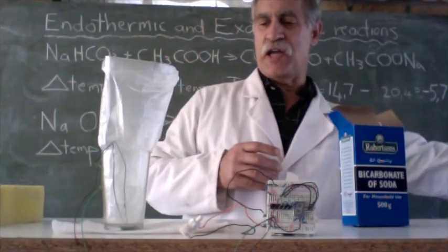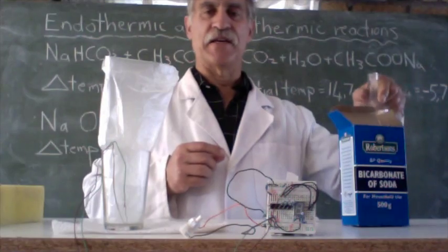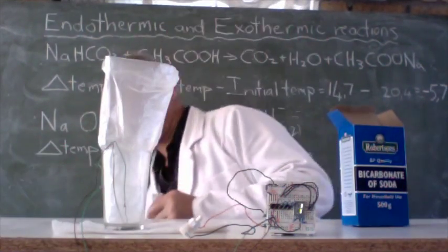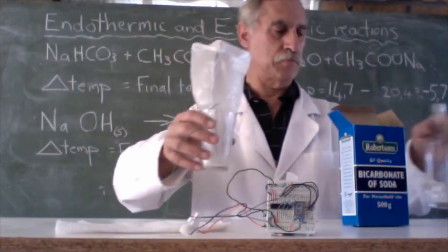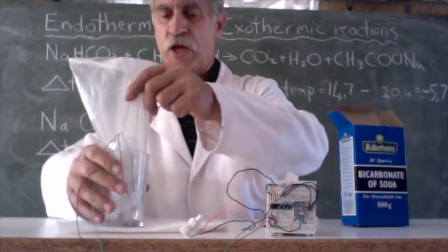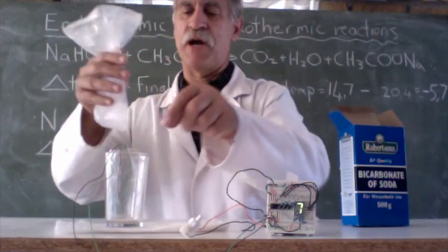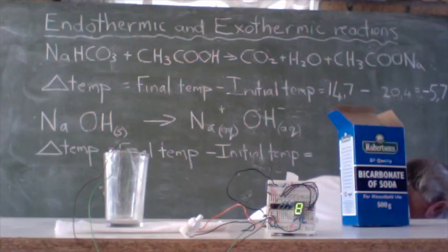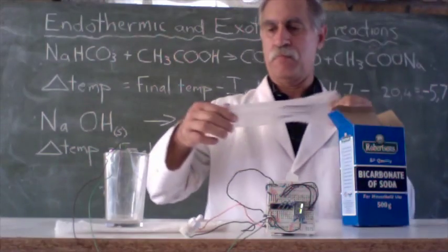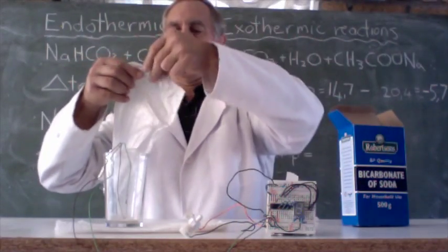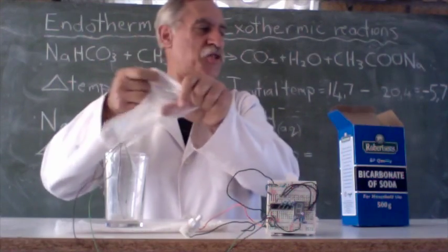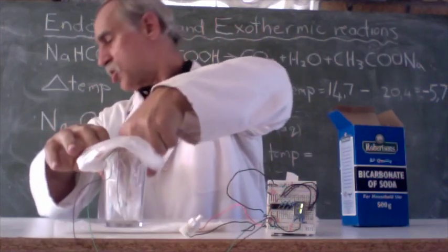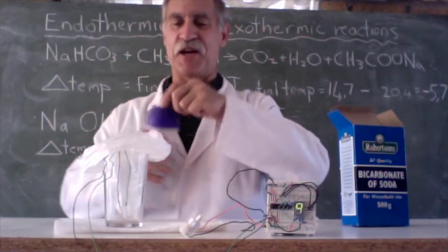Now let's try a different reaction. How about we try dissolving sodium hydroxide. So let's get another bag and let's put some water in it, just plain old water, and let's dissolve some sodium hydroxide in it and see what happens.